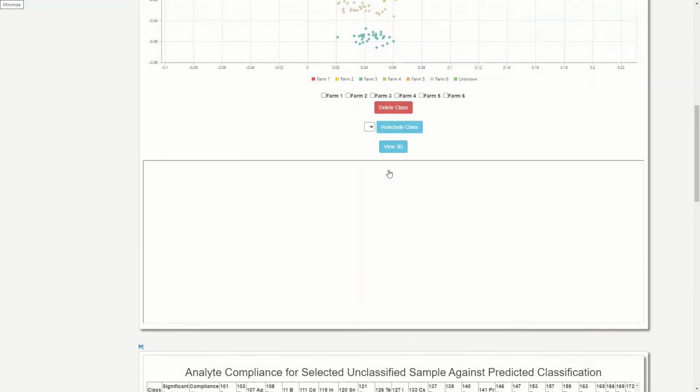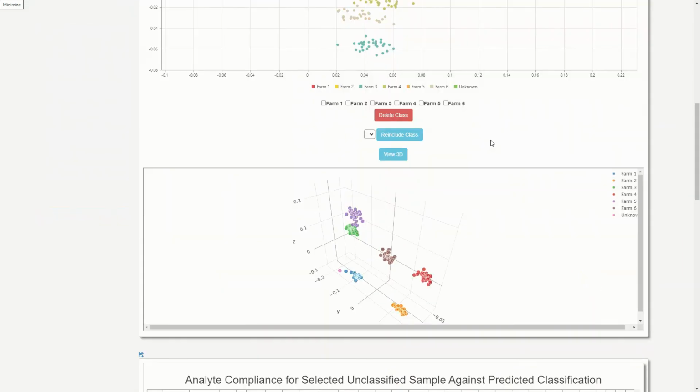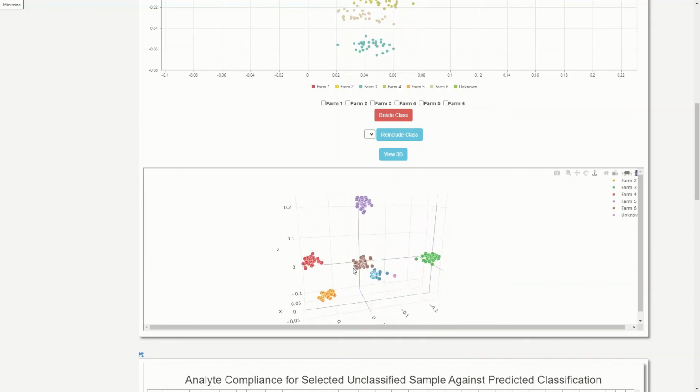Once that loads, and we're quite confident, we'll go up here and replace that value. So here we go, there's our unknown value in pink there. When you scroll around, you can see that the separation is very clear.